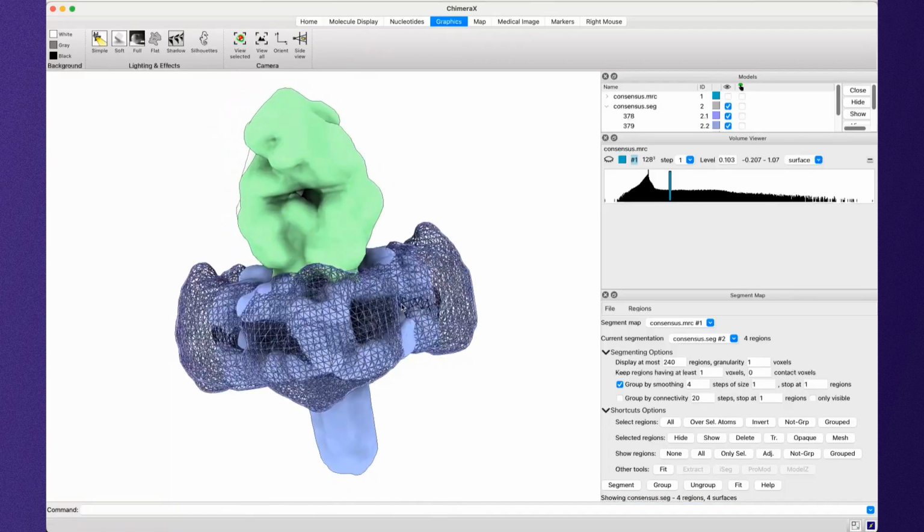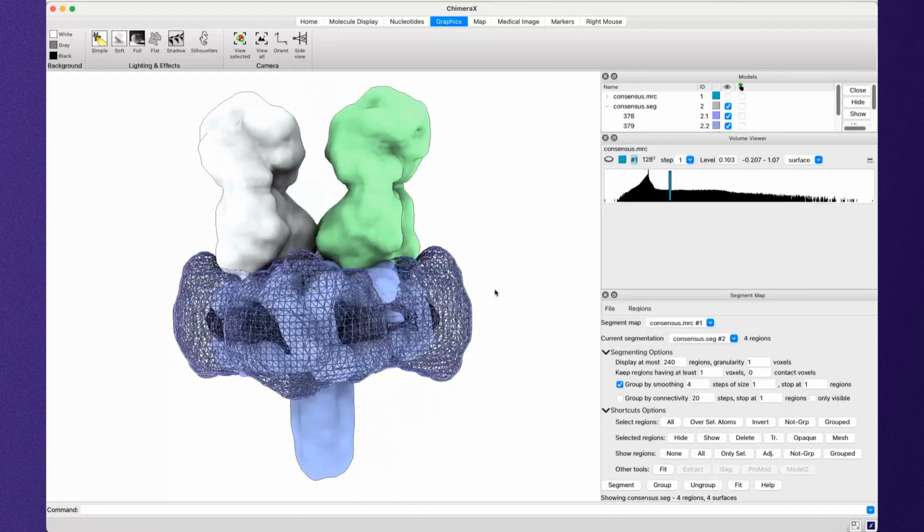Your segmentation doesn't have to be absolutely perfect because once we plug this segmentation into the mesh generate job, it will be expanded to fill the entirety of your mask. So as long as you get it mostly correct, that will be sufficient for what we need to do.